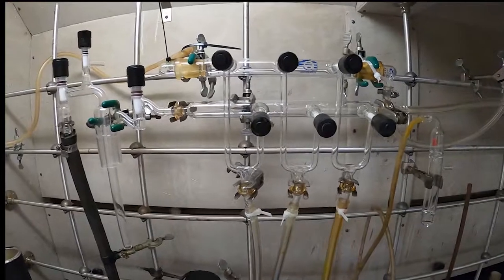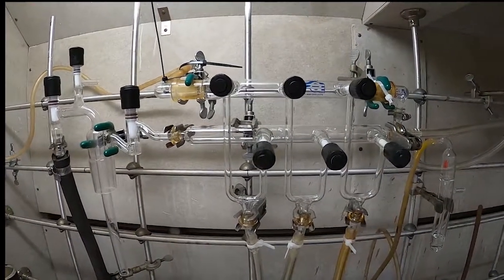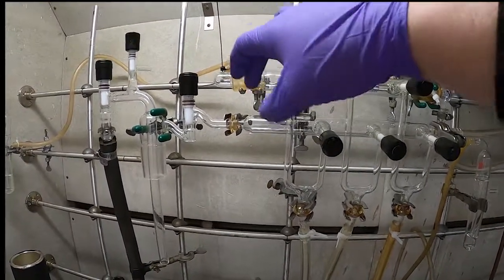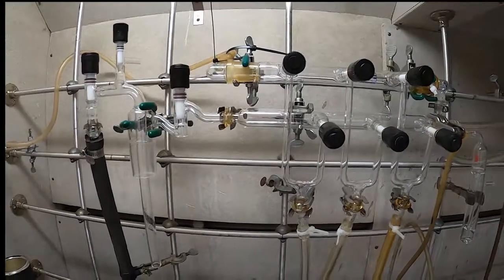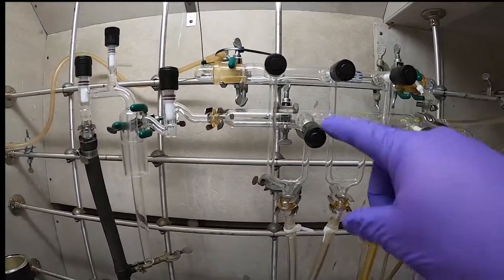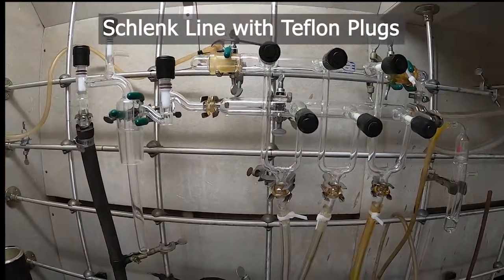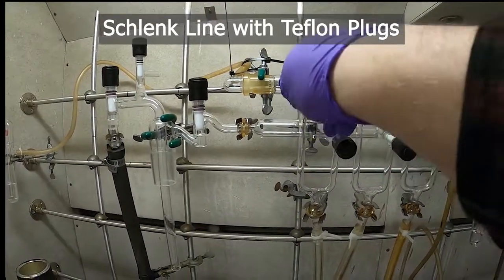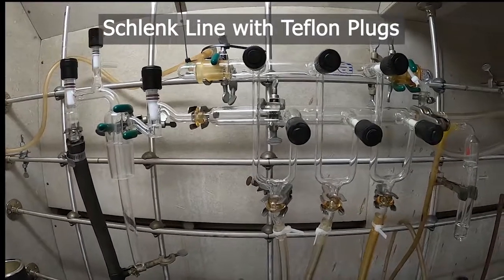The Schlenk line is an apparatus that allows us to perform reactions under inert atmosphere. They consist of two glass tubes that are connected to various ports. There are two styles that vary on the way the ports are set up. This is the type with Teflon stoppers. These can allow the flow of either your inert gas or open up to your vacuum line.